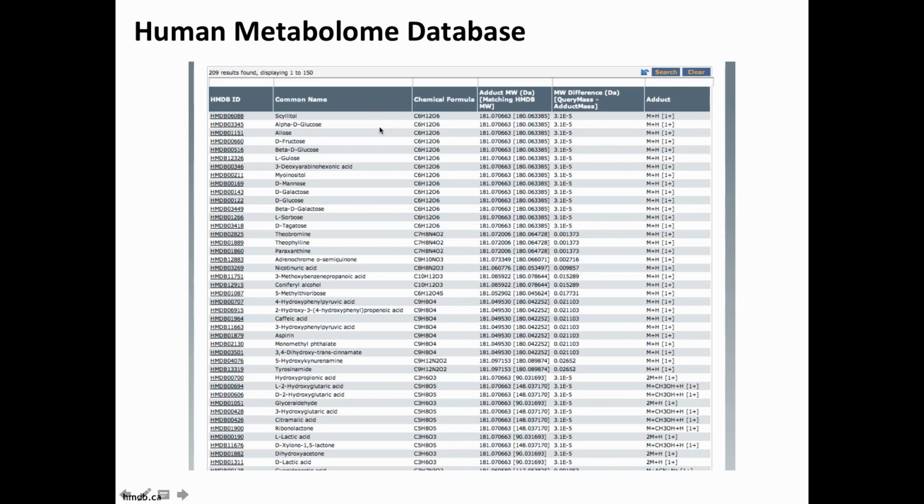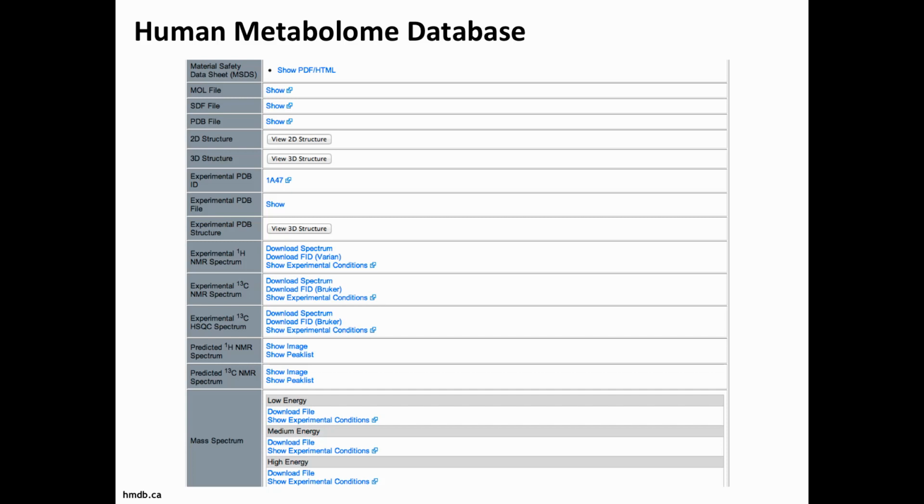You can also see the compositions here. You see the first hits, they are closest. They're all C6H12O6. So it figured out the right molecular mass, or the hits have the right molecular mass for glucose, which is not surprising because that's what we started with searching. You can click on these entries and then get additional information. You can look at experimental spectra as well.